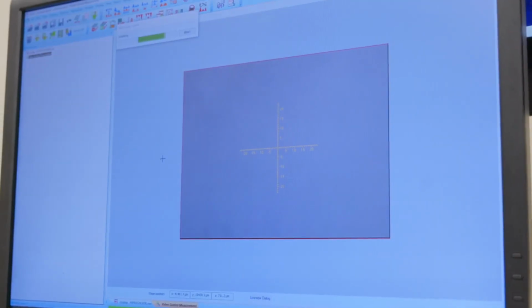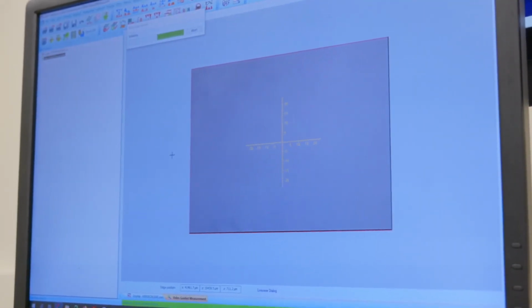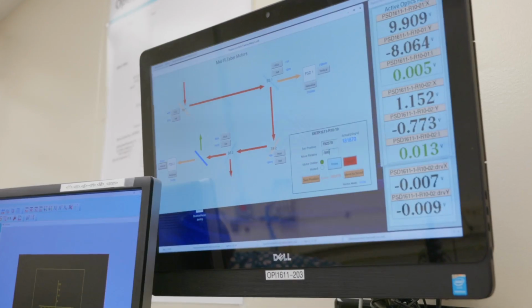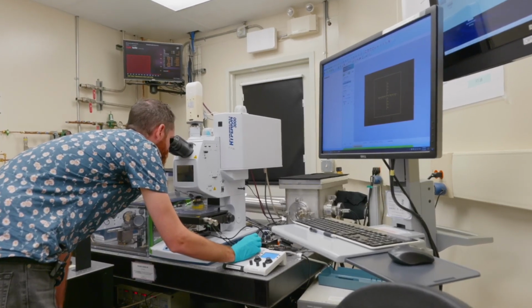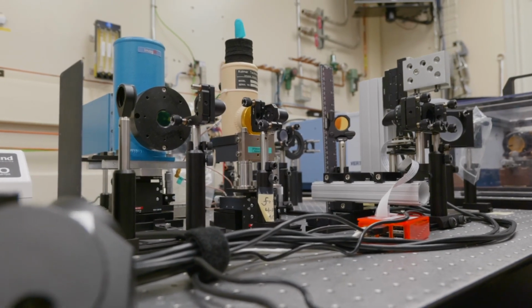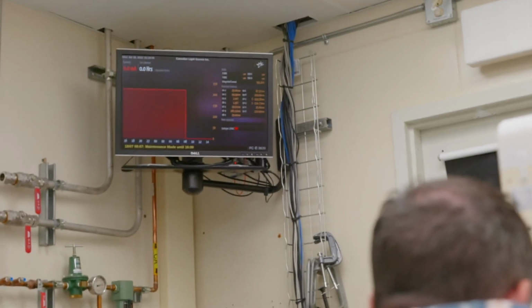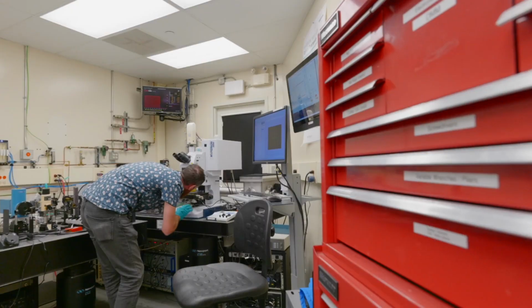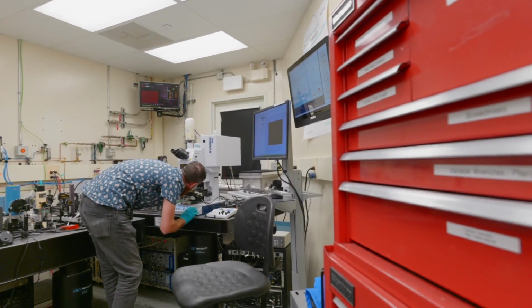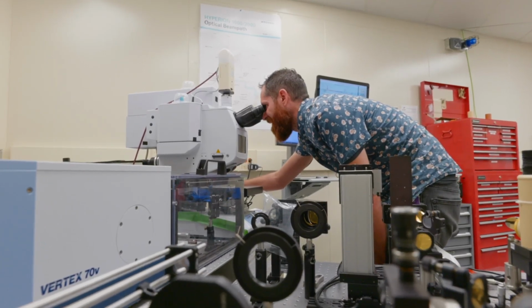There's a lot of ways in which infrared can help solve or help look into a variety of problems. The question that's often asked is, why would you want to use synchrotron infrared? Really, it comes down to small spot sizes and being able to map your data. We're able to get to the diffraction limit and image this diffraction-limited IR spot across the sample. And so we're able to do what you're not able to do on your benchtop instruments back in your lab.